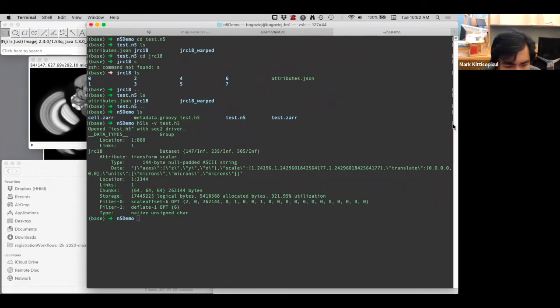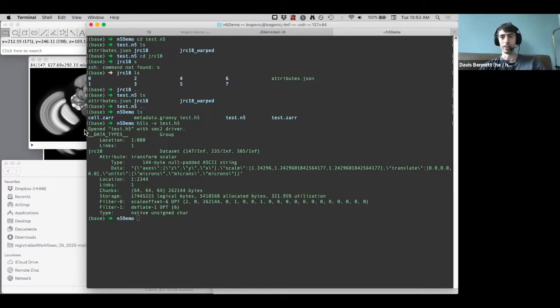And earlier, Davis, we were talking about whether the metadata belongs at the group level or the dataset level. I think you had some opinions about that and where the current NGFF format is. I'm not happy about that. So where would you rather have it? Well, I would follow common sense, and metadata that describes an array should live with the array. That would be my opinion.